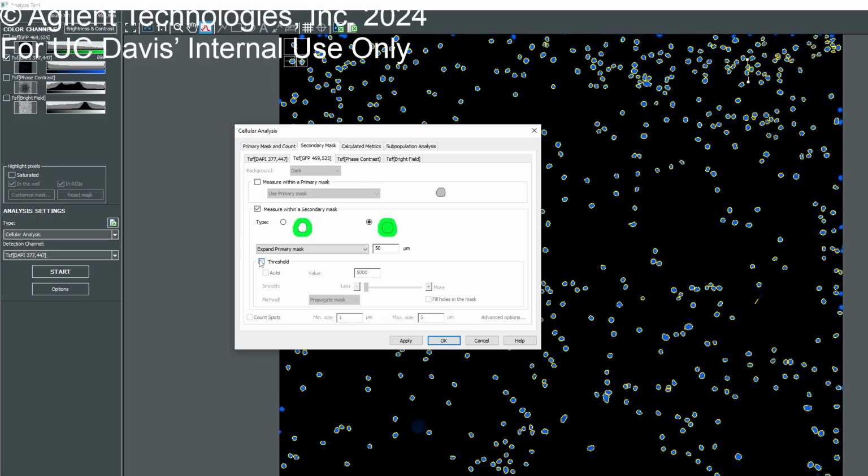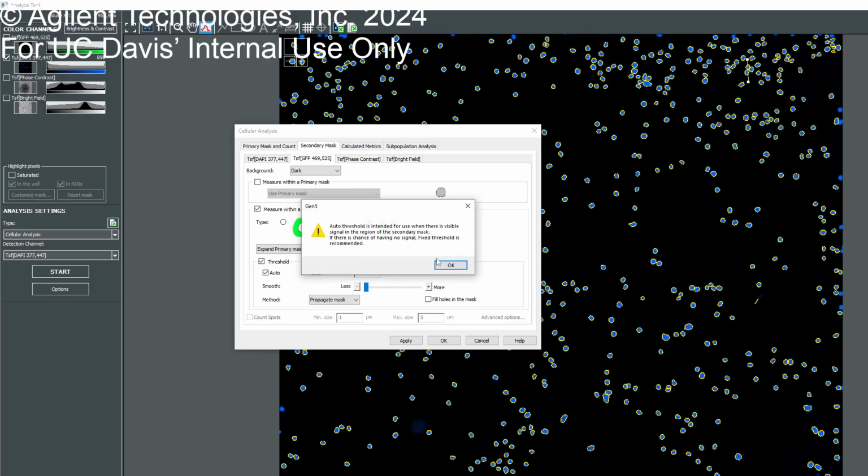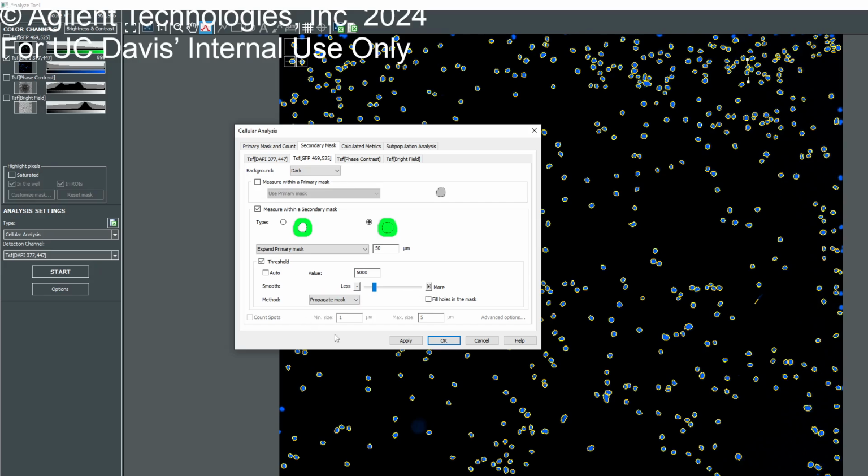I also just use the random auto threshold for now. And I apply like a couple, actually that's fine, 5000 is fine on the default version. And then we can change that accordingly. And then I apply like 2 or 3 cycles of smoothing to make it even. Otherwise it's going to look very funny. Yep. So, click OK.